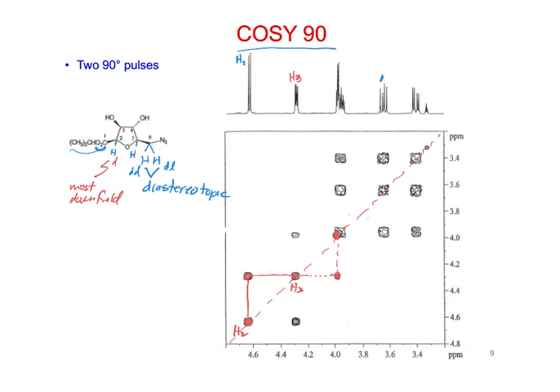Notice that this section has off diagonal peaks going this direction and this direction, and these are much fatter than this one here. So this one is going to this peak on the left side, and this fatter one is going to something bigger and wider in here. So the size of this off-diagonal peak can tell us how they're aligned together. That's really nice.